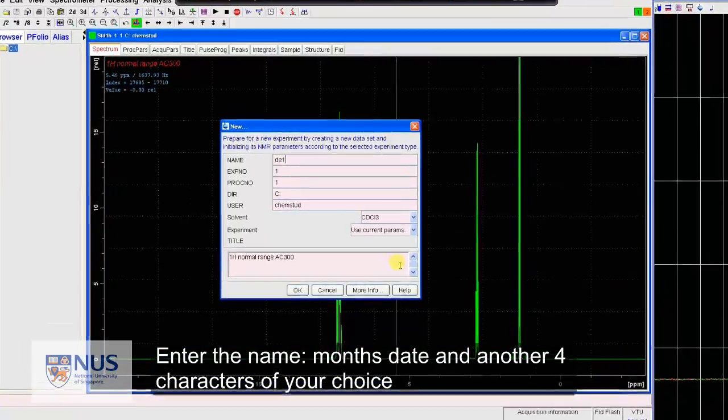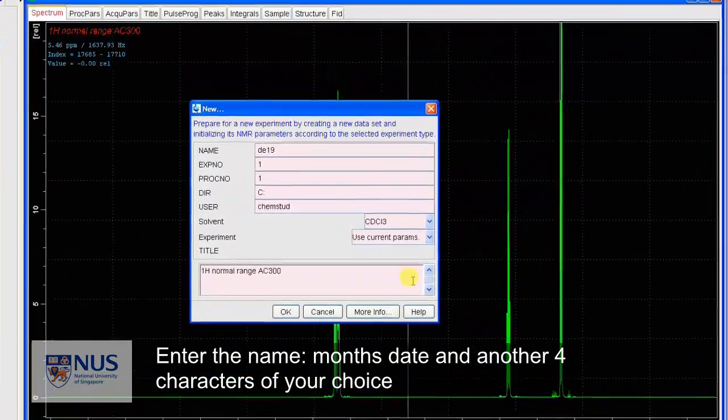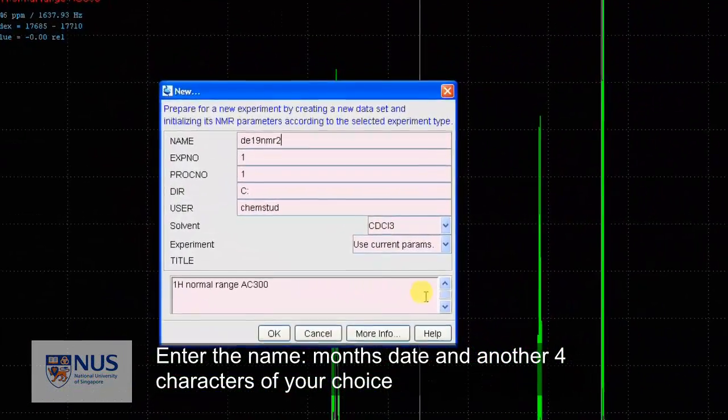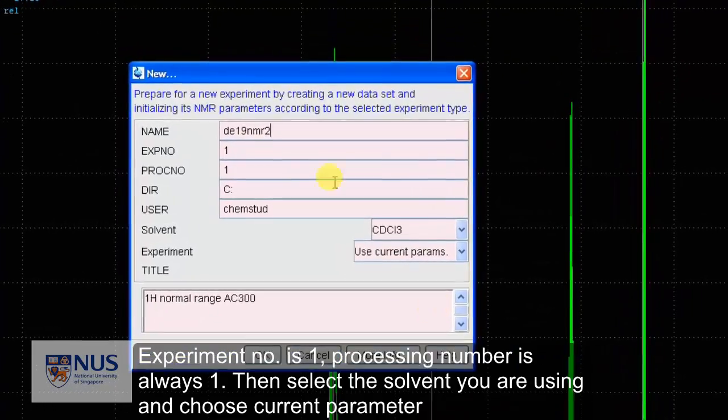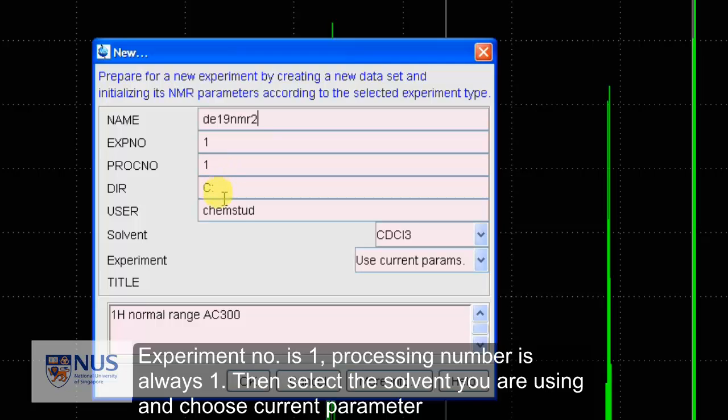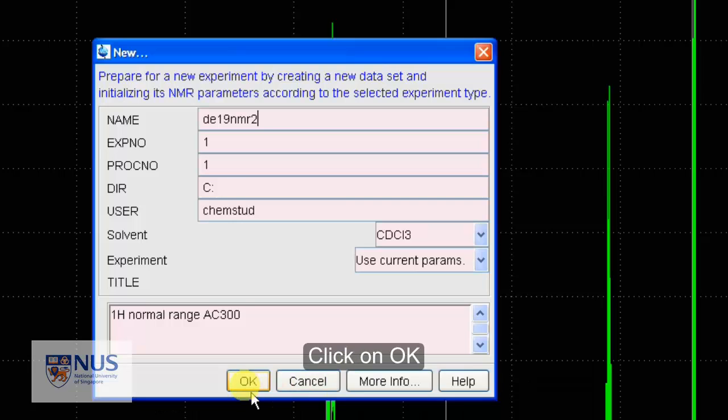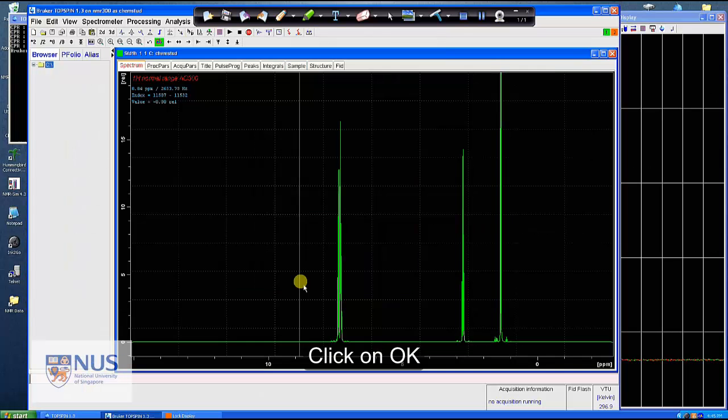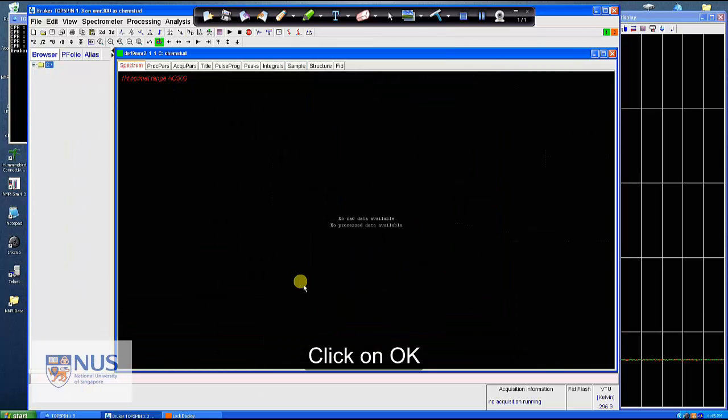Now enter the name in month, month, date, date, and another 4 characters of your choice. Experiment number is 1. Processing number is always 1. Then select the solvent you are using and choose the current parameter. Type the title to indicate your sample name and conditions. You can also do it later. Click OK.